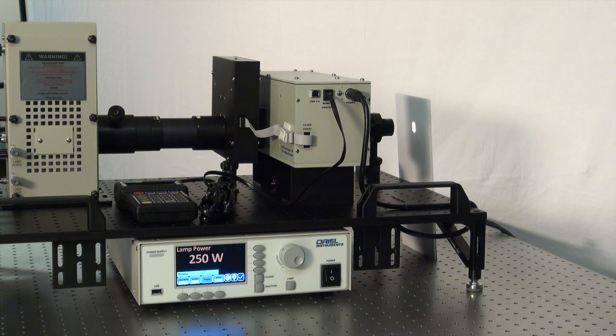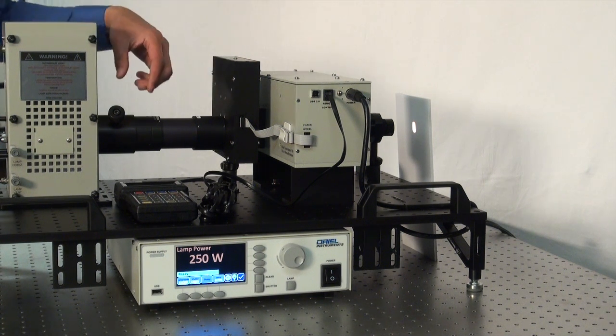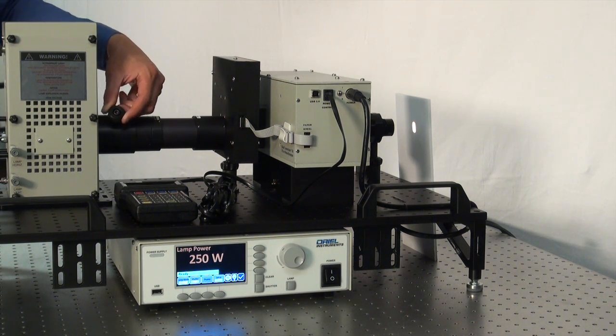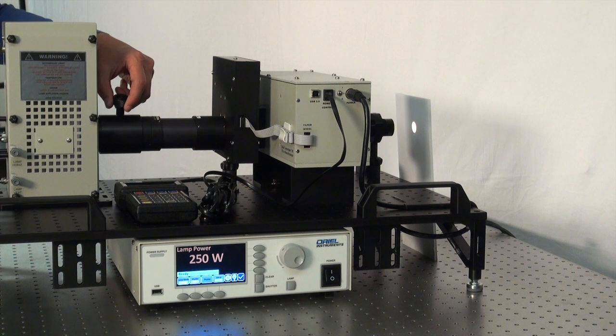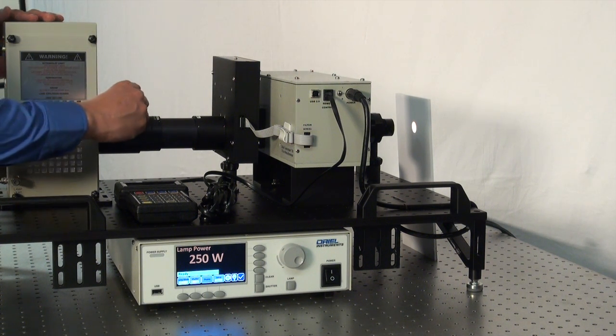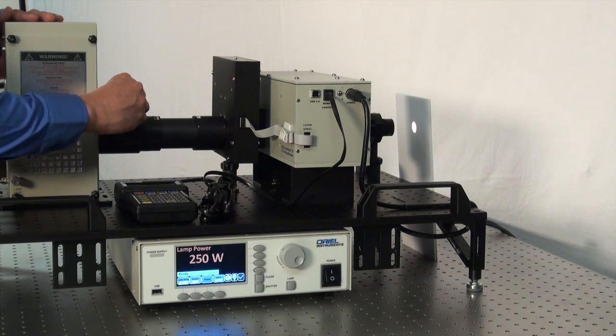So now that we have the filament and the reflected filament images superimposed onto your light output, we're going to defocus this. Using the focusing lens, we're going to unscrew this to the left, give us some room on the focusing lever. And as you defocus the filament, what you should see is a clear, uniform, spot-sized light output.